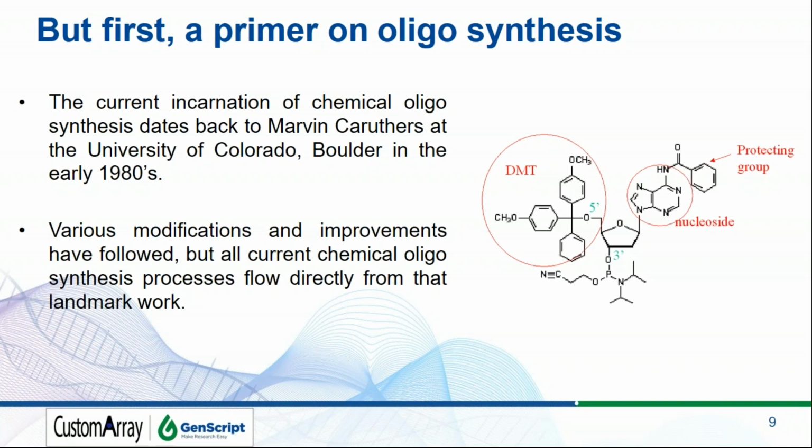In that work, he basically sets out this molecule. This is a phosphoramidite, or a monomer. This is an A phosphoramidite. So there are certain common features. What you see here is a number of protecting groups.